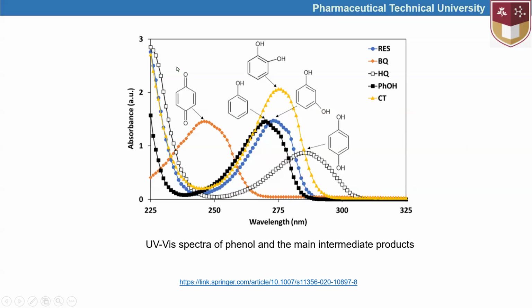And this compound does not have OH; instead it has carbonyl groups linked to the benzene ring, and had the peak at around 240 nanometers.